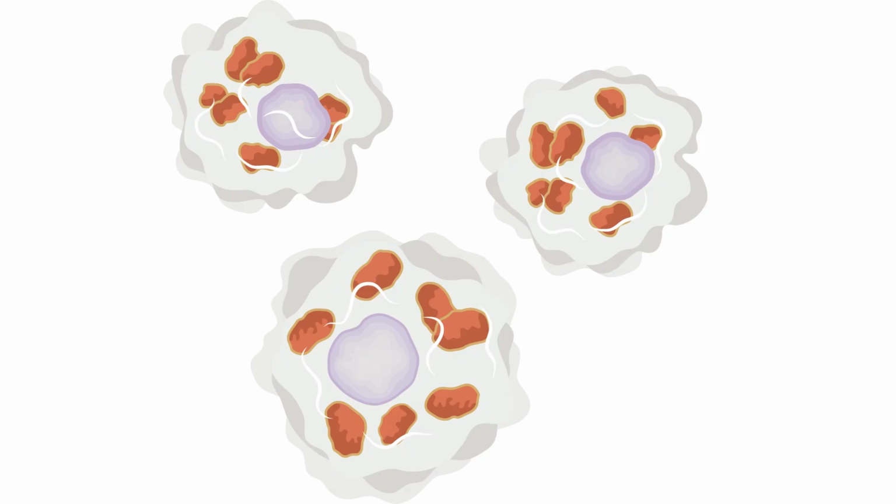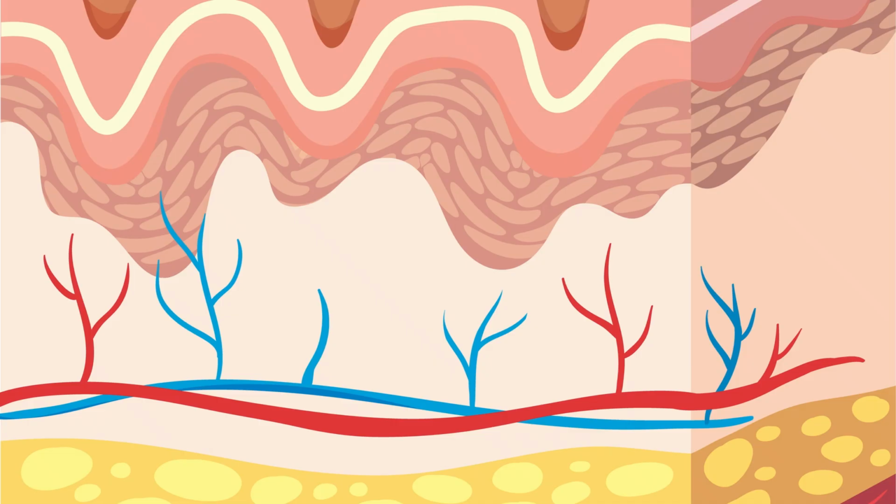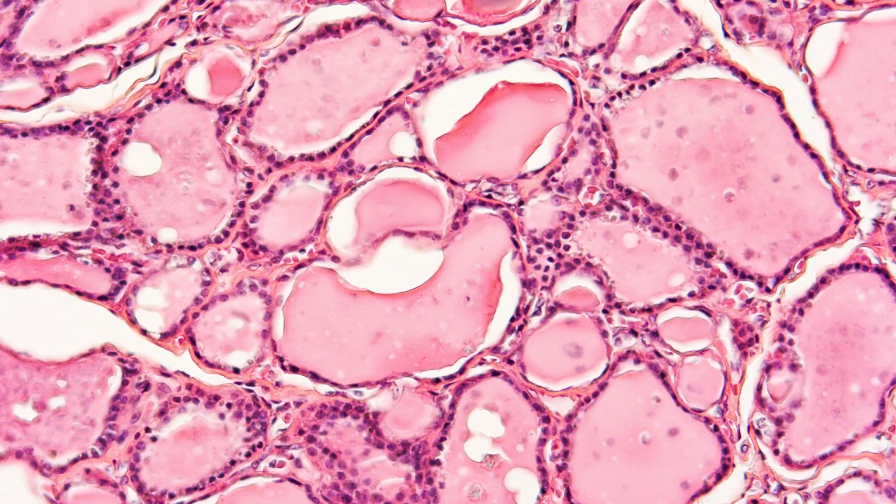Applications. Reticulin fibers, nerve fibers, and certain microbes such as spirochetes are often stained with silver staining. It is also used in pathology to detect amyloid and in neurohistology to study the structure of neurons.